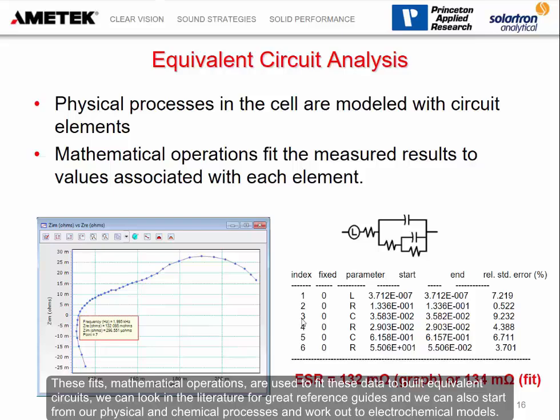To build equivalent circuits, we can look in the literature for great reference guides, and we can also start from our physical and chemical processes and work out to electrochemical models.